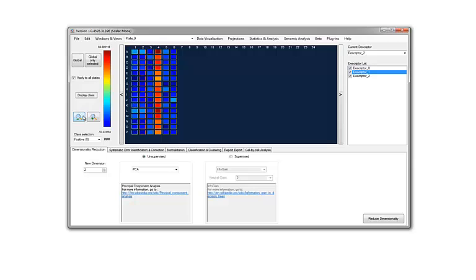If you want to change the class of one or many different wells, you first have to select the class you want to set up. For example, let's say class number 3, and then you can click on one well and you see that the surrounding color is changing. You can do this more quickly for a larger number of wells by clicking on the background and moving the mouse just like that, and you will see that all the wells are changing. So this is quite obvious.